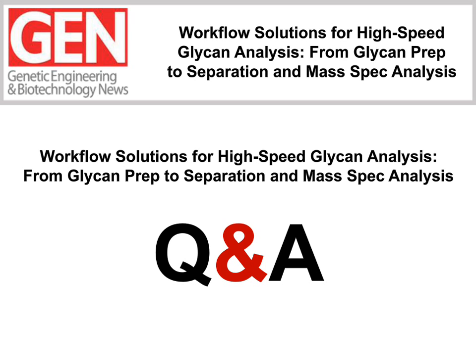While some expert glycan mass spectrometry methods can distinguish between some types of linkage isomers, it is usually easier to assign linkage isomers based on retention time or using exoglycosidases like Oskar already explained. In practice, many analysts working with monoclonal antibodies usually avoid these steps by assuming that the glycans have the most common types of linkage.